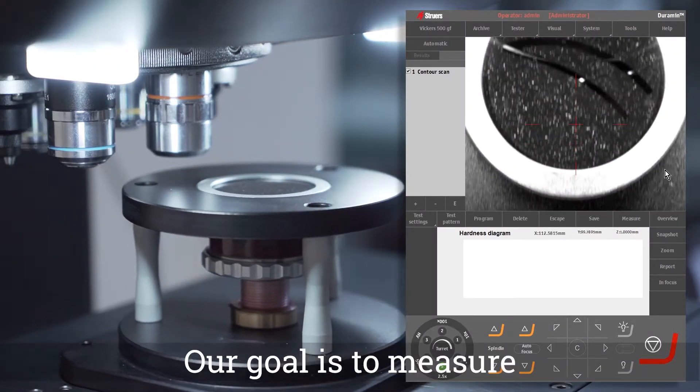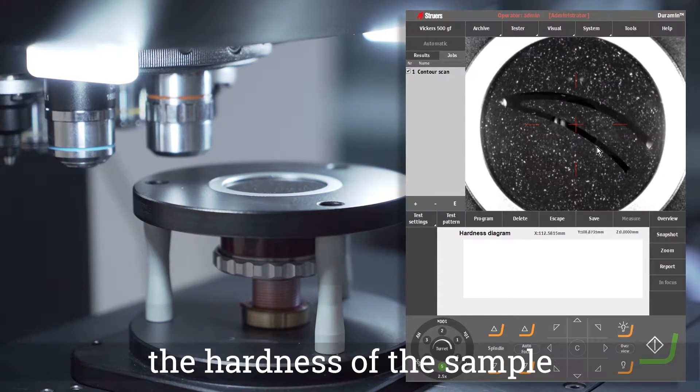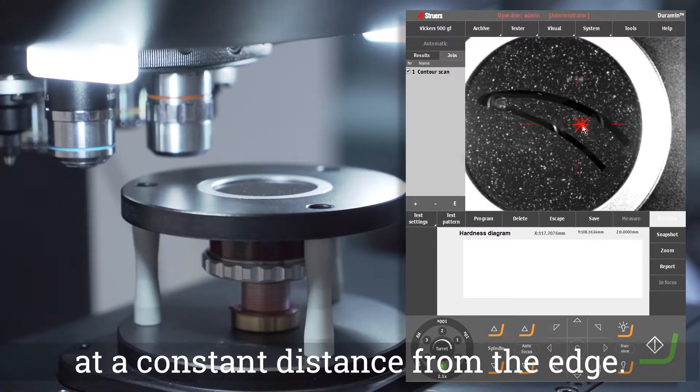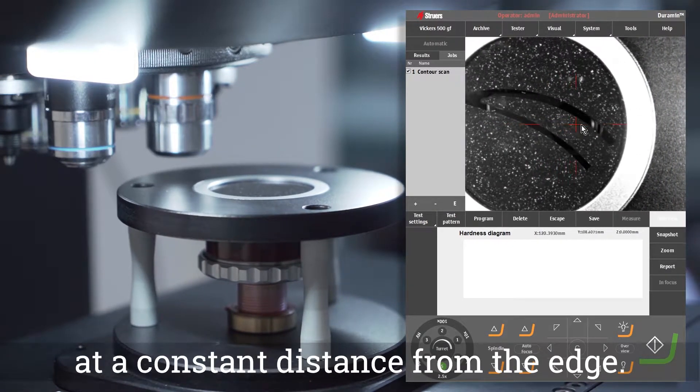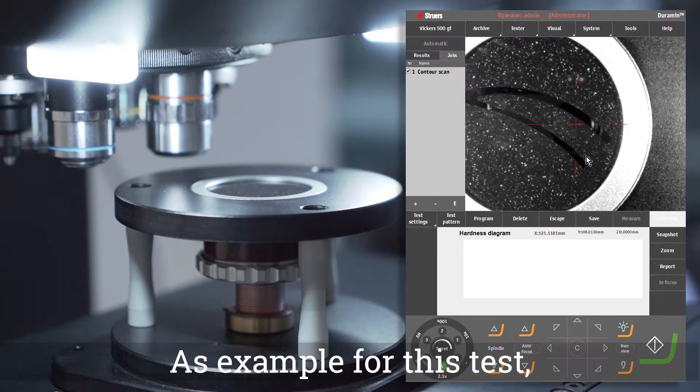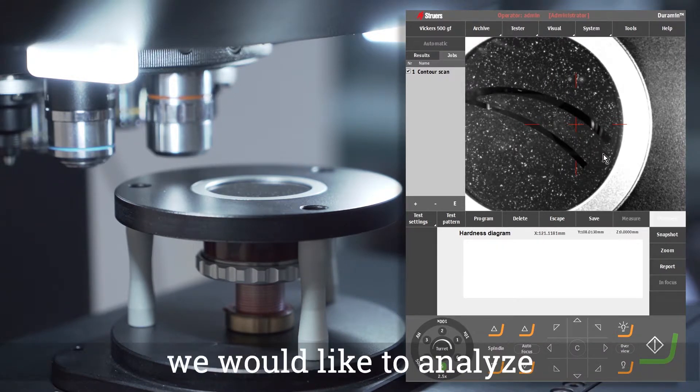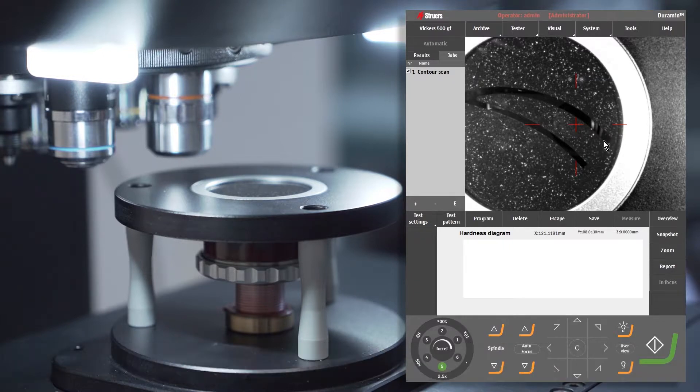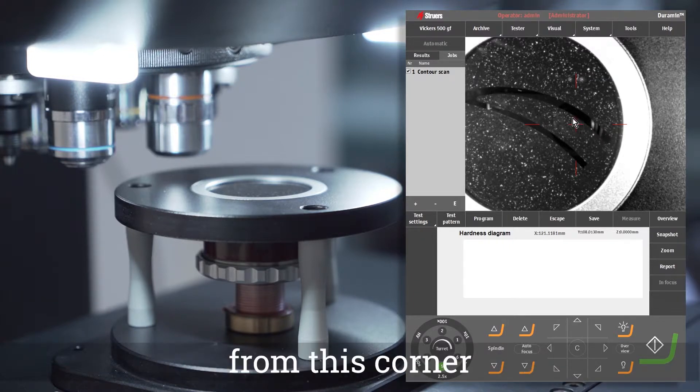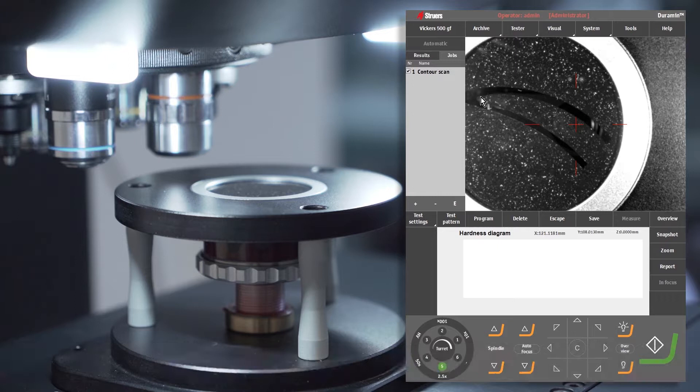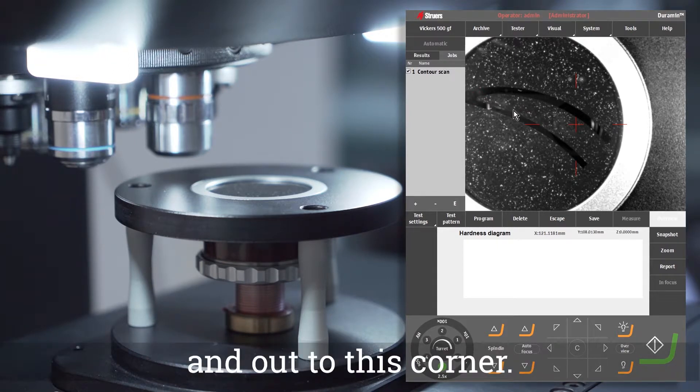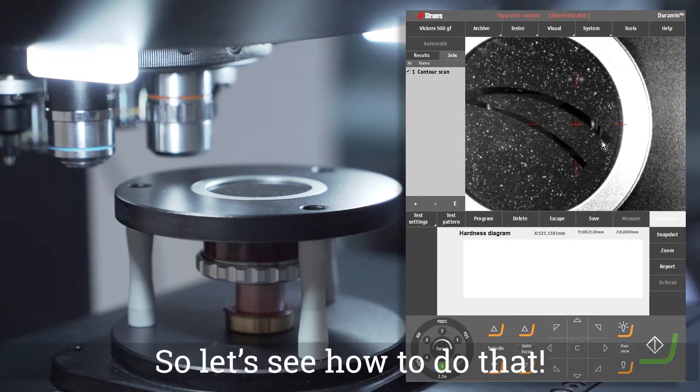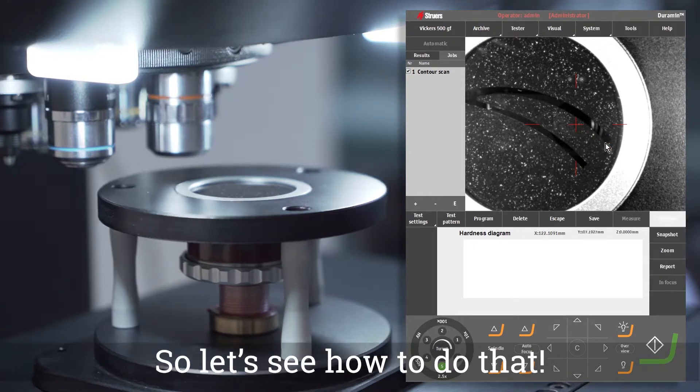Our goal is to measure the hardness of the sample along the profile at a constant distance from the edge. As an example for this test, we would like to analyze only the inner profile of the sample from this corner into the middle here, and out to this corner.